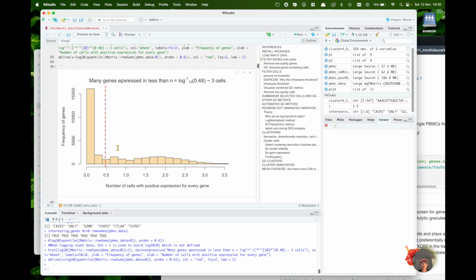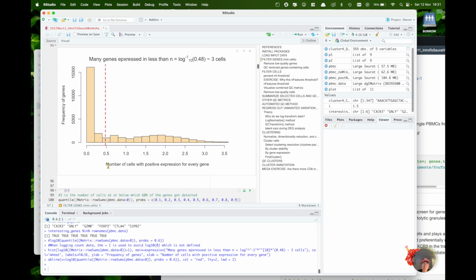So one of the ways that you can do that is to check what you have filtered out. What are the cells, and the genes in those cells, that you filter out by setting this threshold, and whether these cells actually have all the QC metrics, which we will go through in the tutorial, that make them really low quality cells. That's how you QC them. But these genes only express in a very low number of cells, whether it's 3 cells like we picked here or 5 cells, and that is a very low number of cells for the expression of a transcript. So they will definitely be something that you don't want to include in your data.